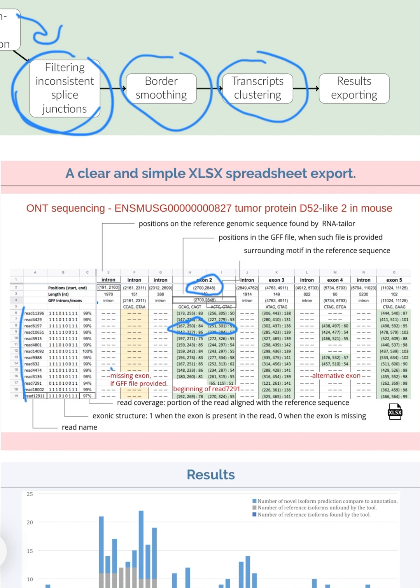And if a GFF file is provided, then known exons can be highlighted. So here, for example, we see that if a column is full, like here, it might show a constitutive splicing dynamic, or if it is not full, it might show a possible cassette exon.